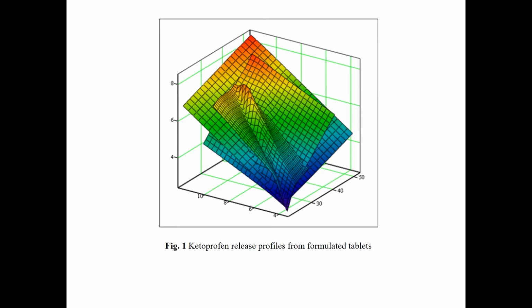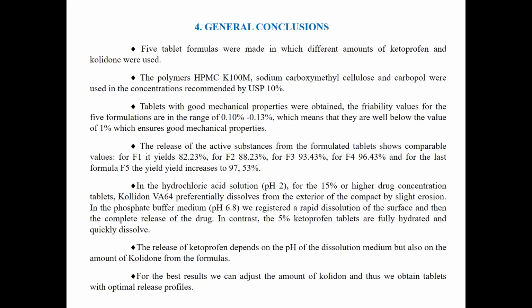In this slide is presented the release profile from the last 3 formulated tablets, F3, F4 and F5, in which we recorded the better release of ketoprofen.